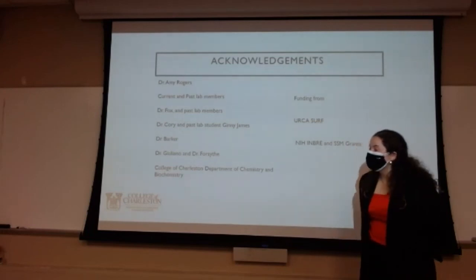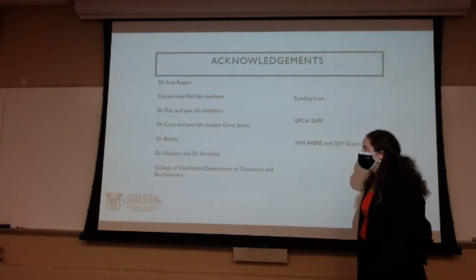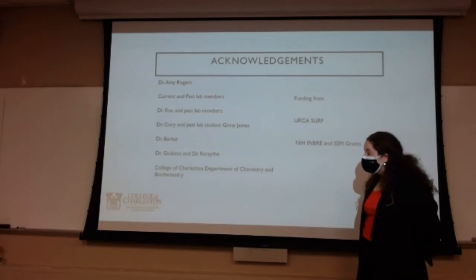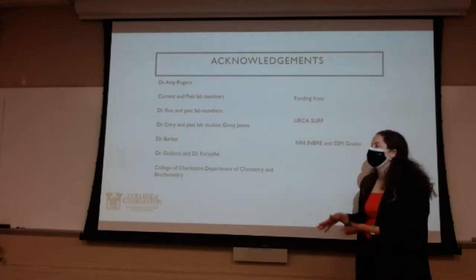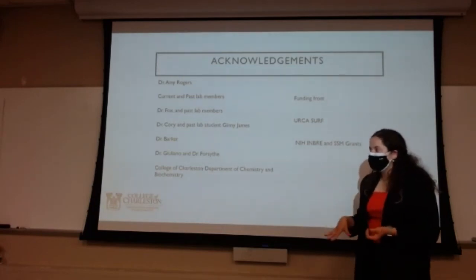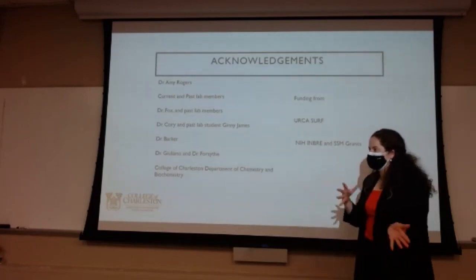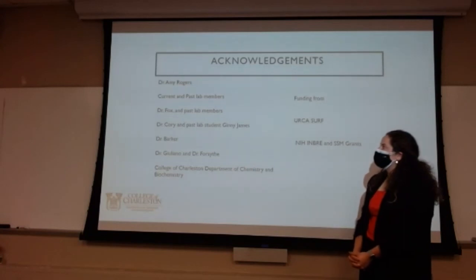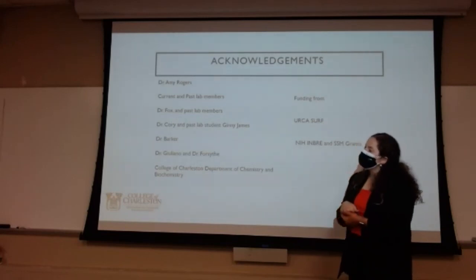That is a great question, and that is what we want to look at. In terms of the proteins, this year we have crystals with the histidine, the R367H mutant version of it, but we're still waiting on the analysis for that because we use the synchrotron time at MUSC from their crystallography lab, but they have to do the workup for us. So it's been kind of a pushback and forth for that one. We haven't gotten to look at the other 2 mutants yet. But that's the fun part.